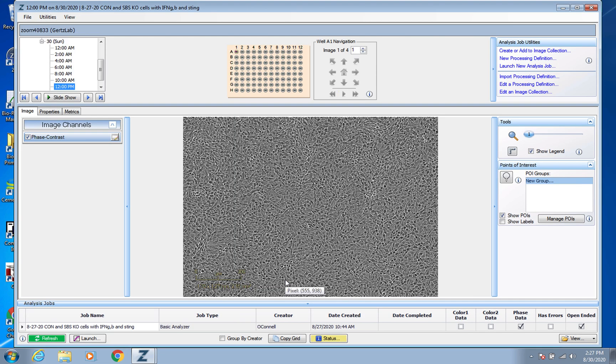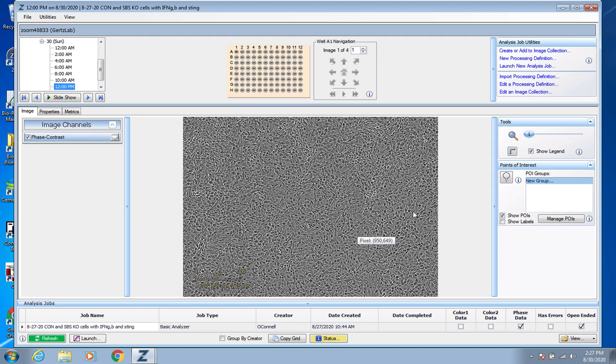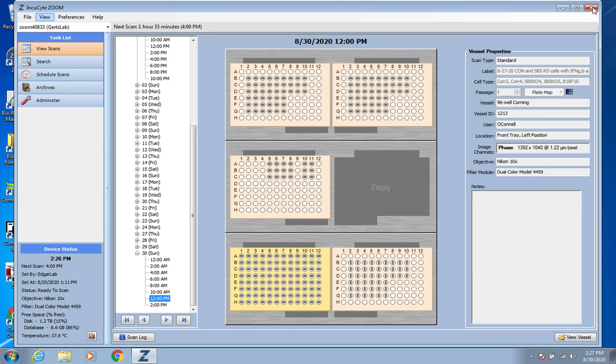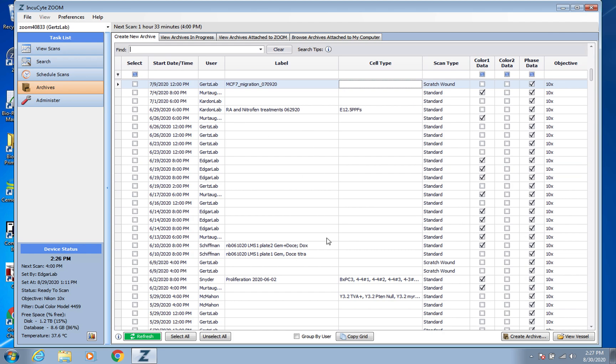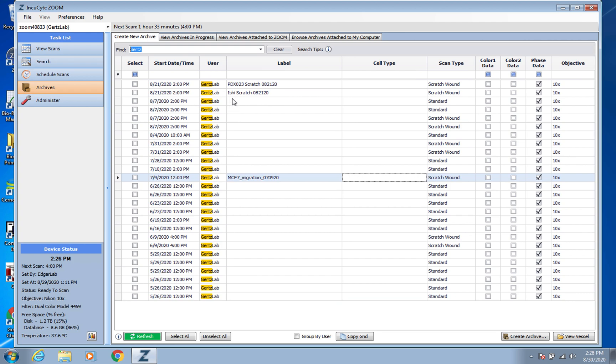That would bring up this screen. But say you're going back way later, you don't remember the exact date, whatever it may be, you can always at any time go over to Archives and it would come up like this.